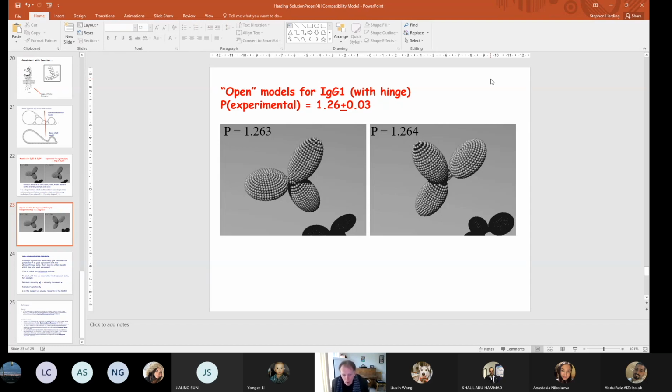However, there could be other models which you haven't tested for, which give equal agreement to the experimental data. And we call this the uniqueness problem. That means that your model is not unique, or not necessarily unique, to the experimental value which is being modeled.